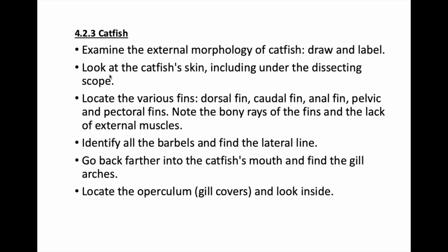Next is catfish. First, examine the external morphology of catfish. Draw and label. Look at the catfish skin, including under the dissecting scope. Locate the various fins: dorsal fin, caudal fin, anal fin, pelvic, and pectoral fins. Note the bony rays of the fins and the lack of external muscles. Identify all the barbels and find the lateral line. Go back further into the catfish mouth and find the gill arches. Locate the operculum gill covers and look inside.